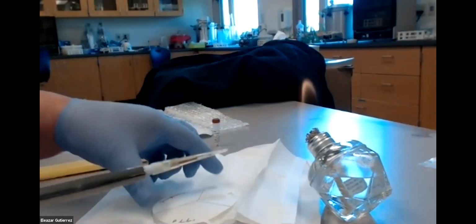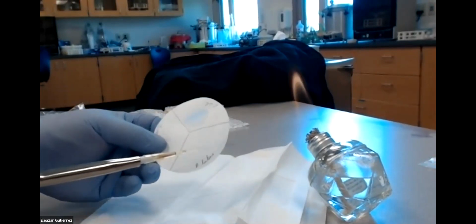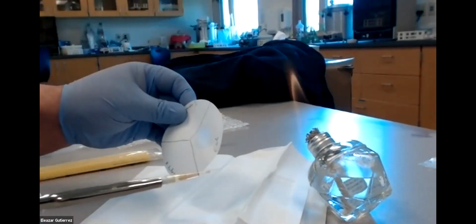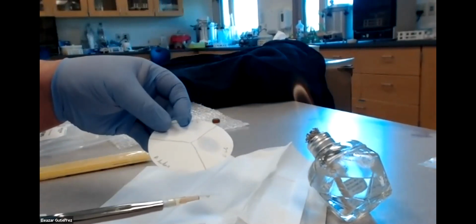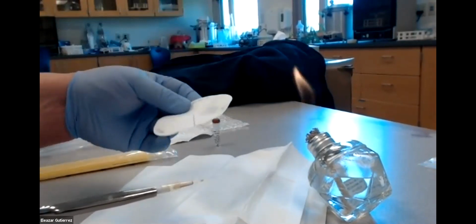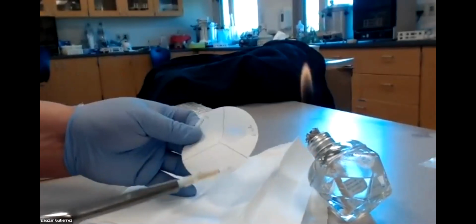So we can look at our little guy right here. What the author did is he tore out the paper and crunched it up so we could see the color better. But I can see mine turning right now. Can you see it, Chris? Mm-hmm. What color do you see? It was yellow from here. Okay. And that's the gist of this.